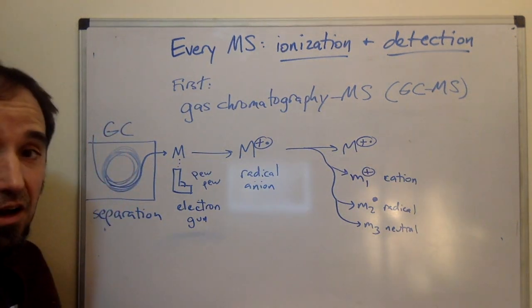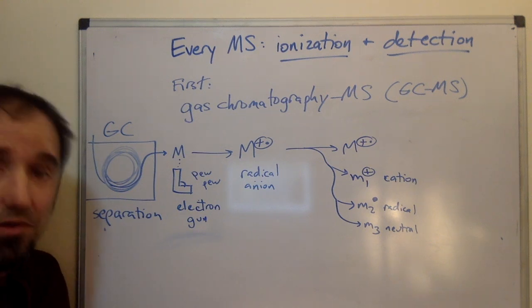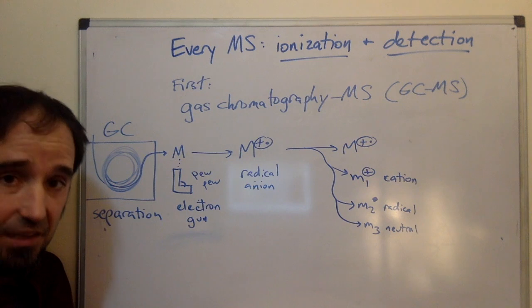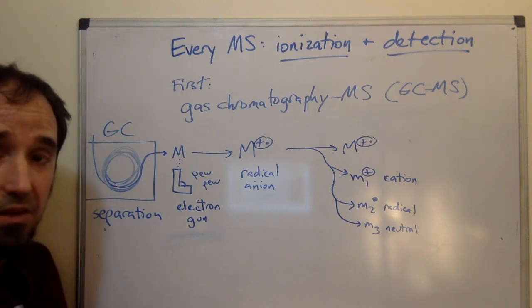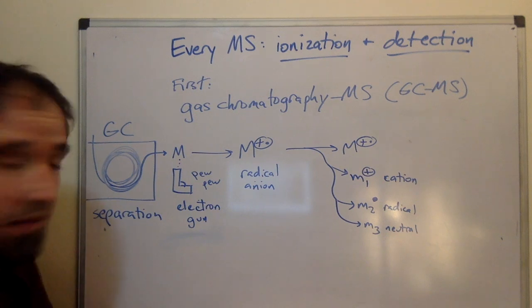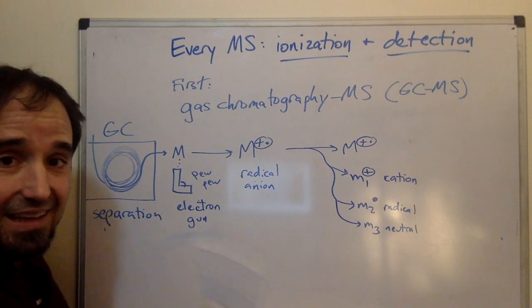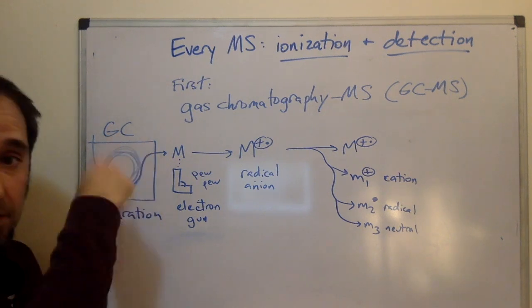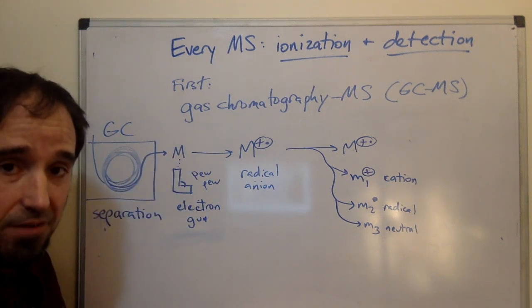Okay, so our GC oven is simply the same kind of chromatography that you learned about with TLC, right? We're separating things on the basis of their polarity, essentially. But here, this is a separation method. We put a mixture of things in, we heat it up so it gets in the gas phase, it runs through a 30-meter column, and comes out sort of separated by component, okay?